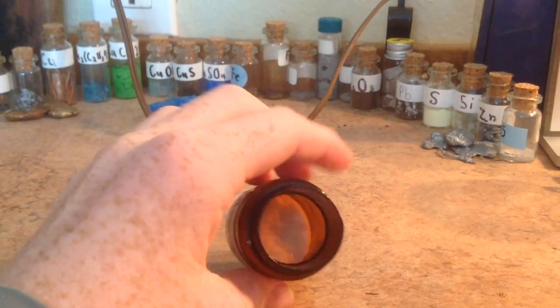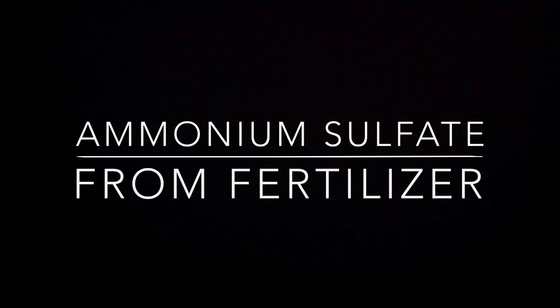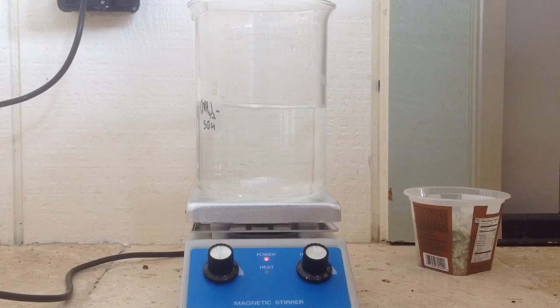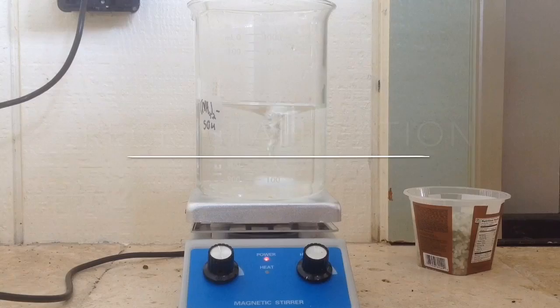It's a white powder, and we're going to use it to make concentrated ammonia in future videos. The first thing you'll need to know about how we're going to separate this ammonium sulfate is we're going to use recrystallization.